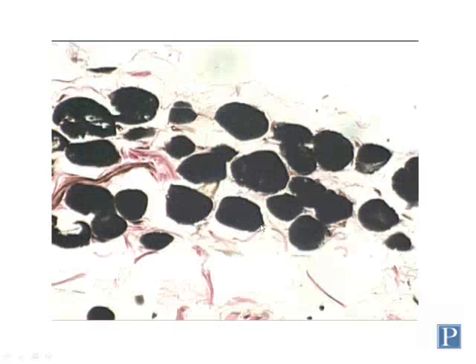This is a section of adipose tissue. Adipose tissue is actually classified as a type of loose connective tissue. The most obvious component of adipose tissue are the large spherical shaped adipocytes, most of whose cytoplasm is filled with lipid inclusions, so they mostly contain fat.